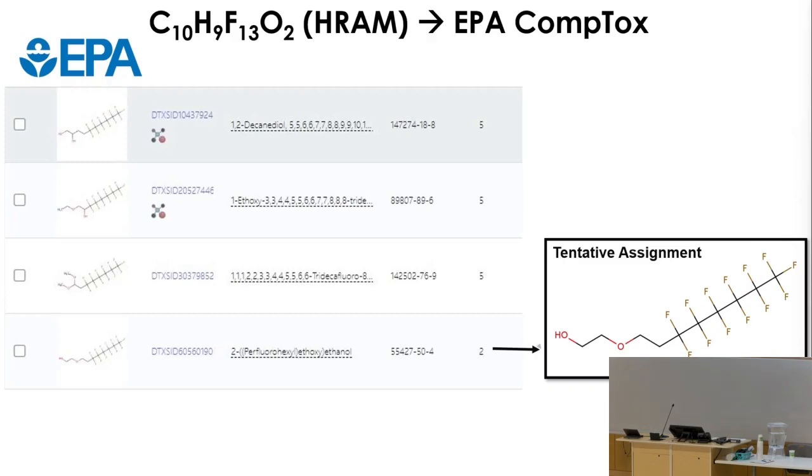I chose that particular one because it seemed the best fit. There was also evidence in the EI spectrum that I was dealing with a glycol type material, CH2, CH2O, and so forth. No identification, no annotation, but at least I have pieces of evidence that I'm putting together to try to determine what I have.